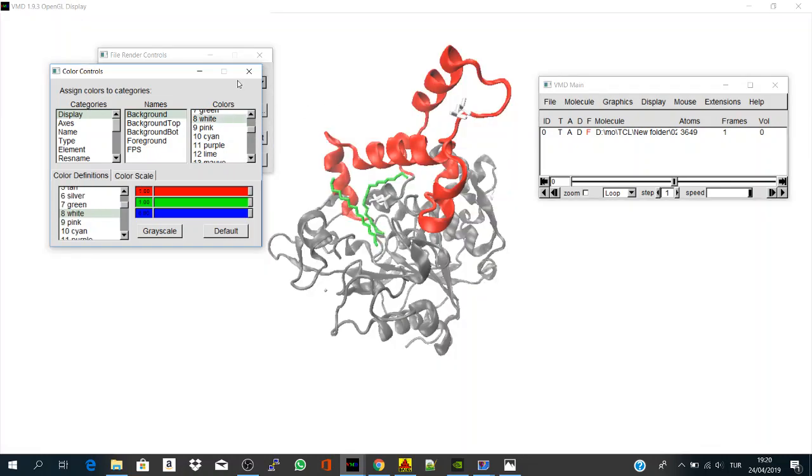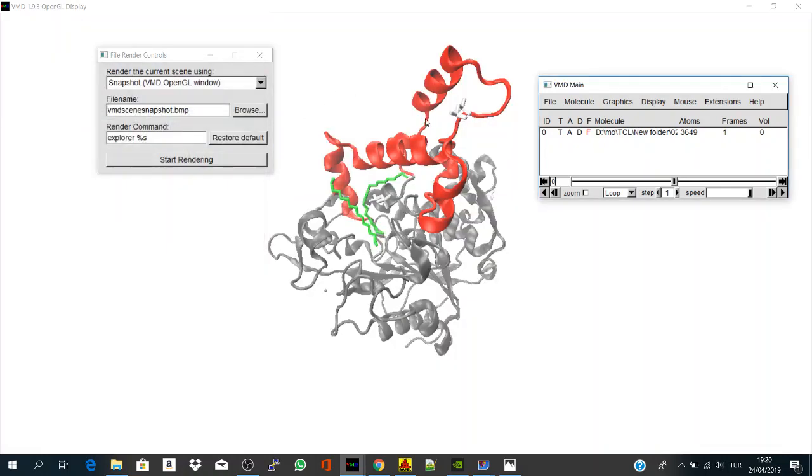Yeah, looks better. One more thing to do is, you can play with the material of representing your structure.